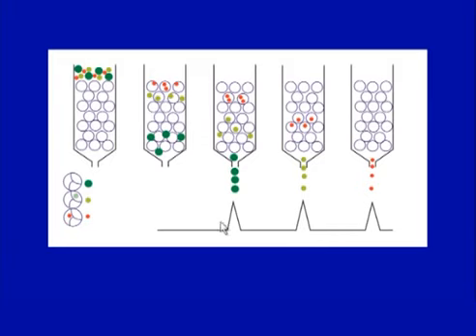In the next one, you can see how the peak resolution can take place if their molecular sizes are far apart, and they could be easily separated into different fractions and utilized for different applications as a purified product. Now, what I was trying to say is, why do you need a long column?